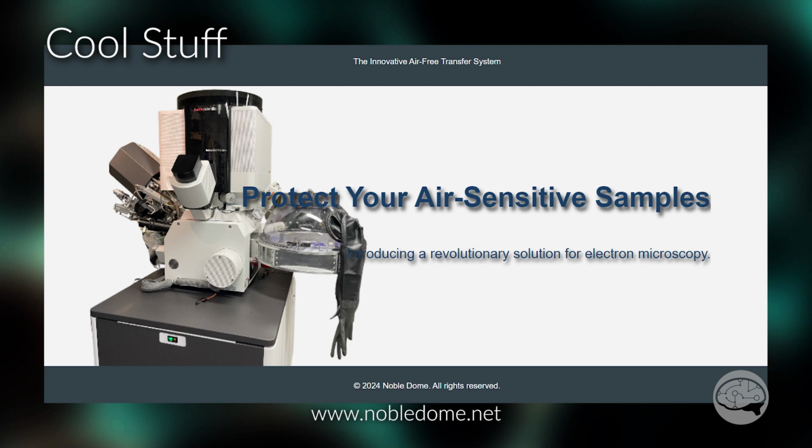In no particular order, from the University of Oregon, there was the Noble Dome. This is a sealed transfer station for air-sensitive samples that fits on the side of an SEM or a FIB. And you can see from this picture that it was originally designed to fit on the side of a ThermoFIB. But the interface could be modified to fit on other types of instruments. That is a cool idea.